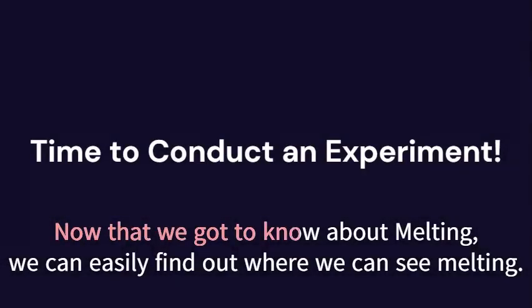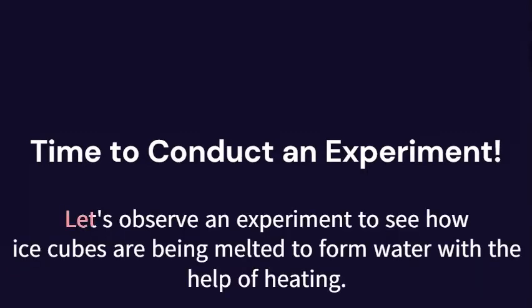Now that we got to know about melting, we can easily find out where we can see melting. Let's observe an experiment to see how ice cubes are being melted to form water with the help of heating.